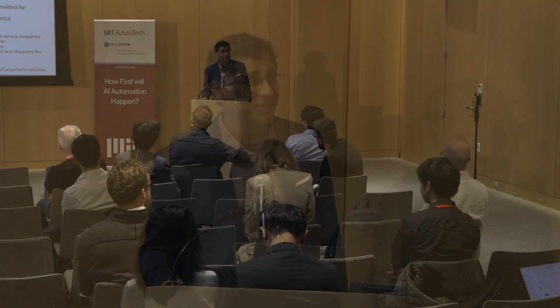Yes. So for the first part, the question was any insights on the multimodality, the complementarity of transcriptional profiling and imaging. Broadly here, the idea is just that if I can look at a cell and take pictures of it, but then if I can also measure the amount of mRNA in it across all the different genes, is that information complementary or not?